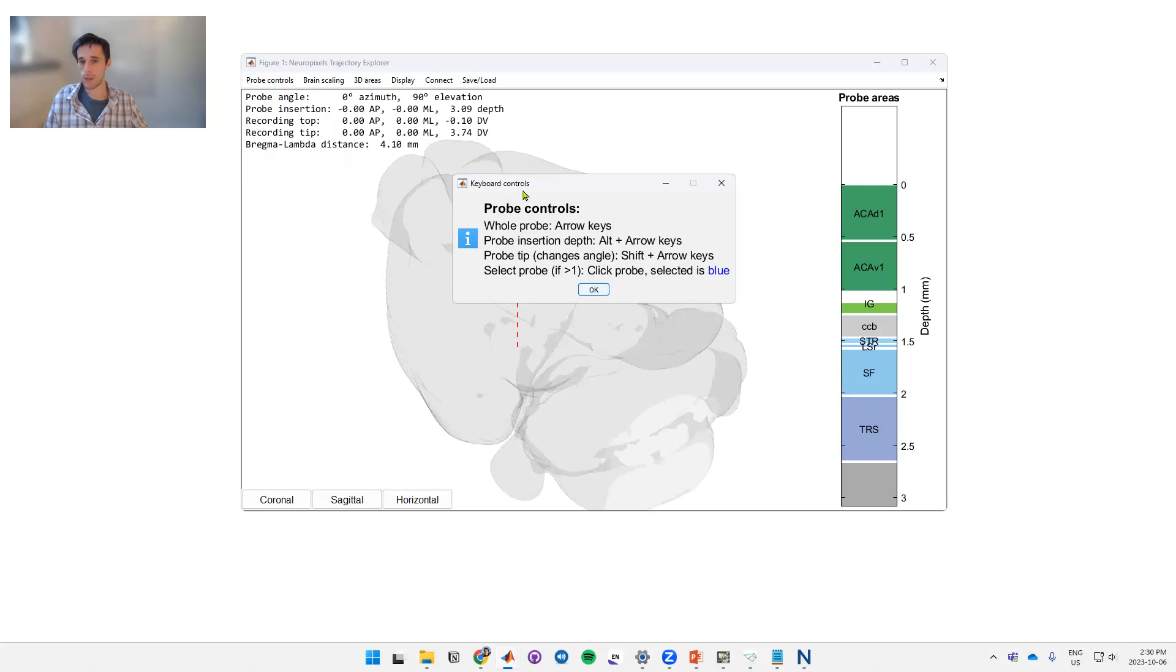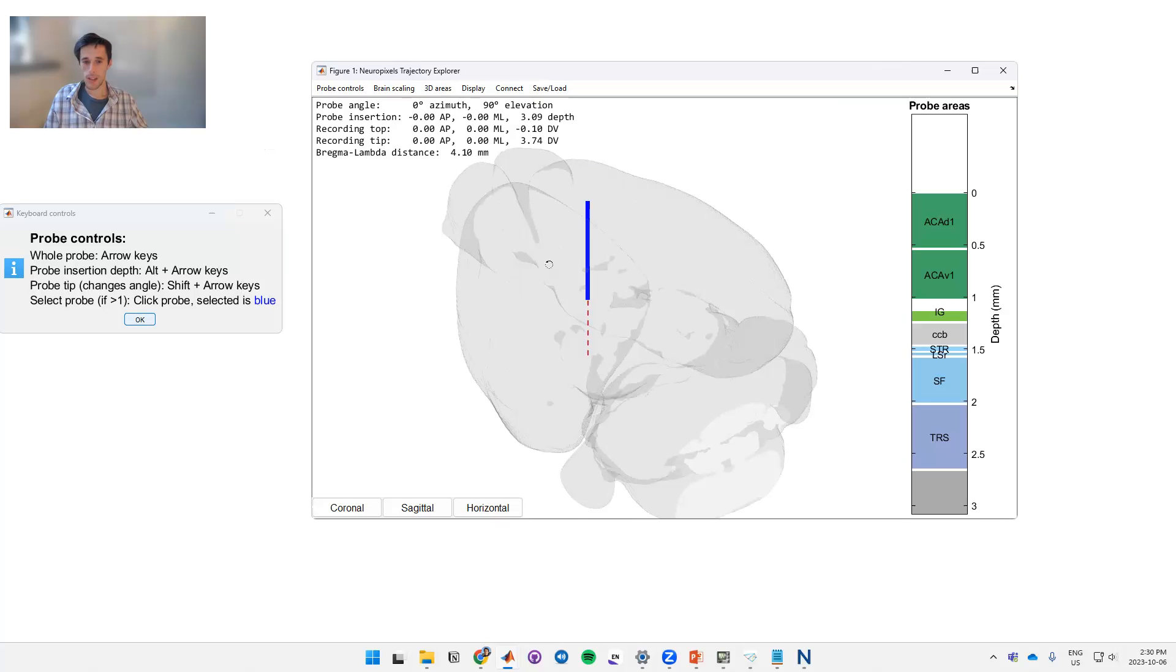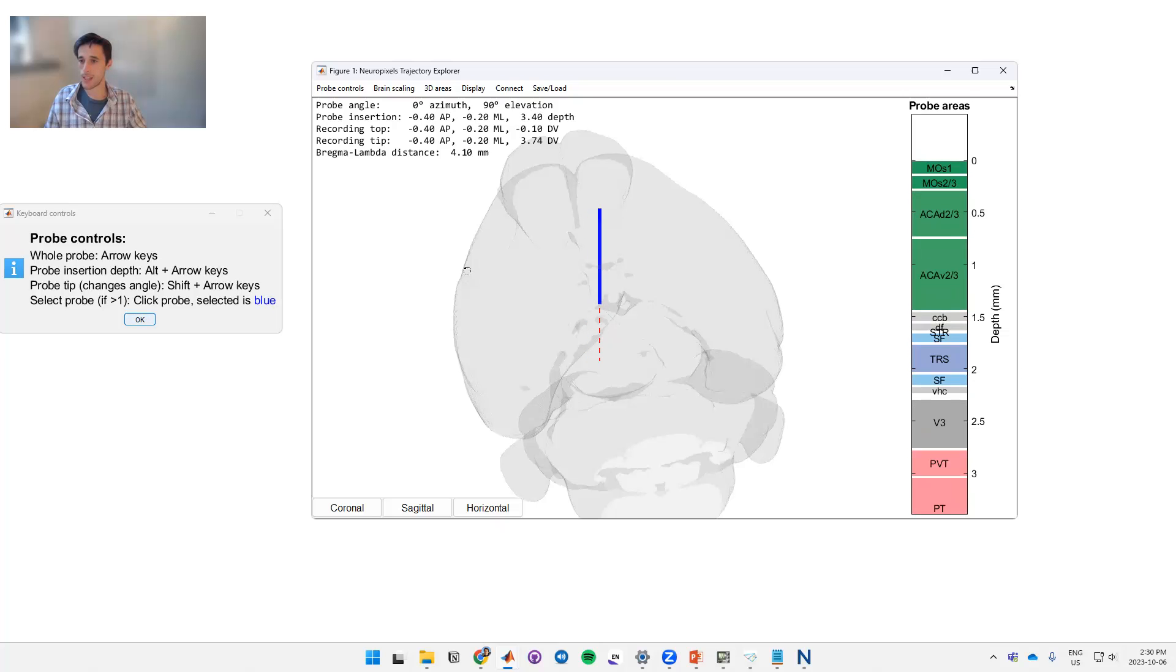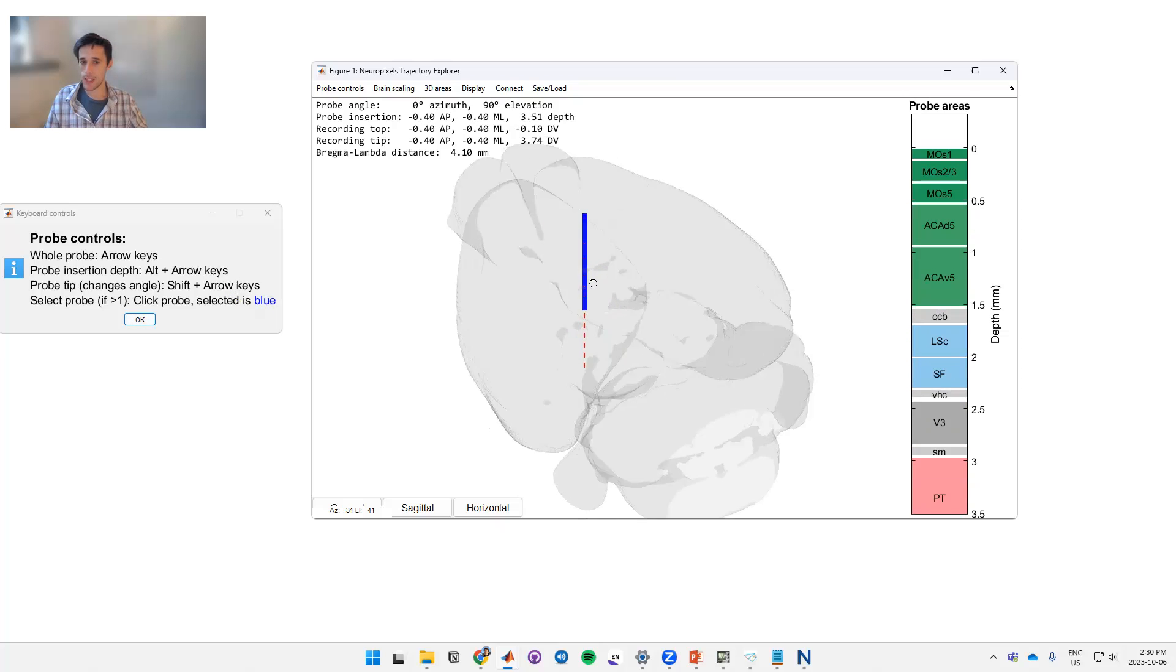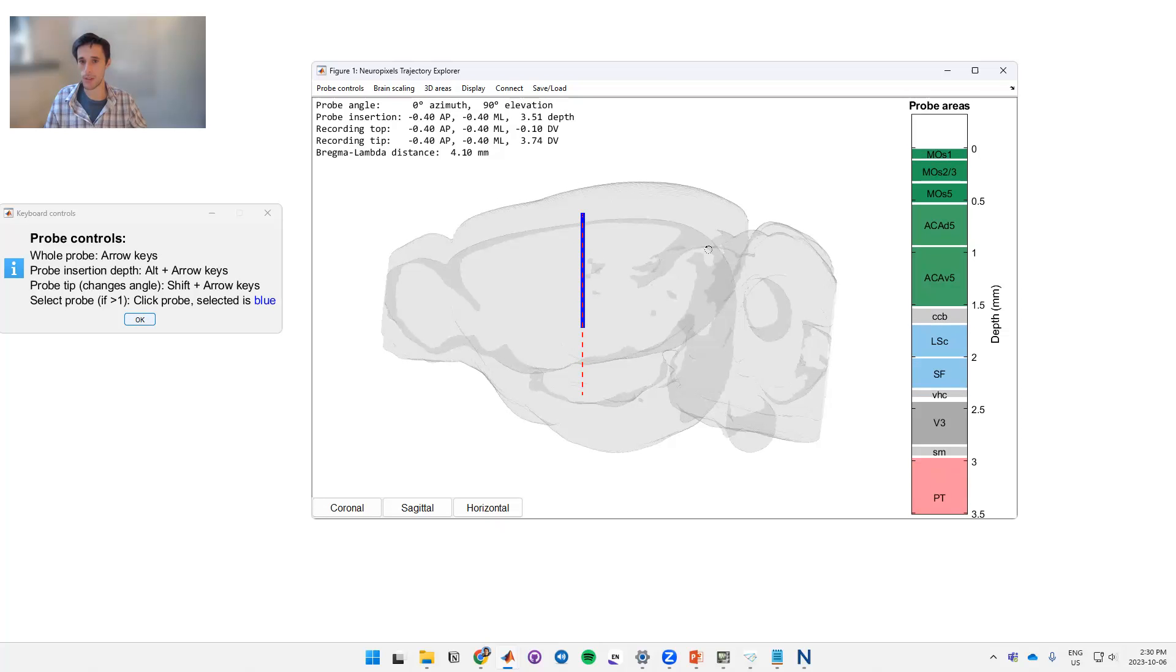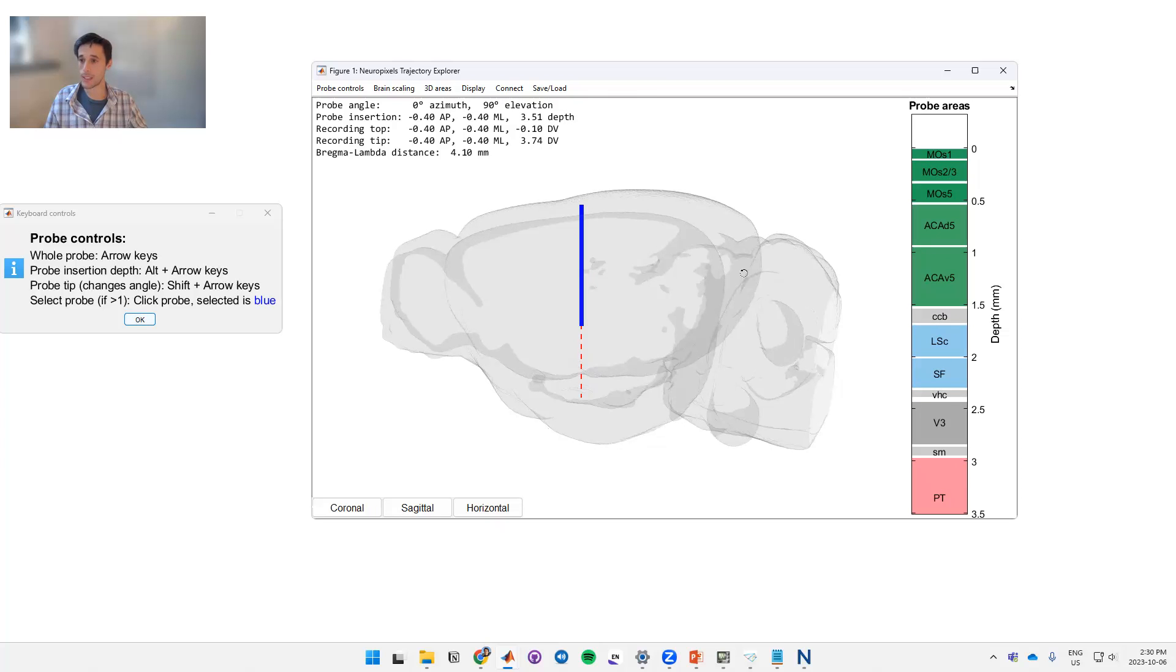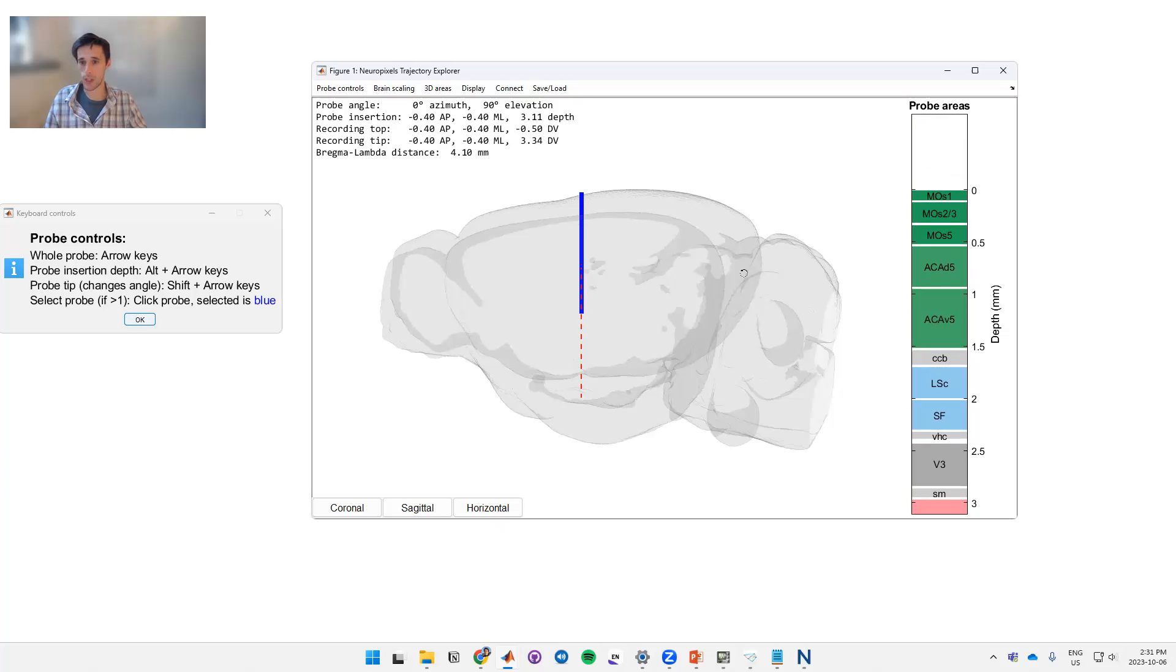There's also a few general ways to move the probe, so I'll just go through those quickly. You can press the arrow keys to move the probe anterior posterior and left and right. If you hold the shift key while pressing the arrow keys, what that does is move the angle of the probe anterior posterior and left and right. If you hold the alt key and press up and down, that moves the depth of the probe along this trajectory.